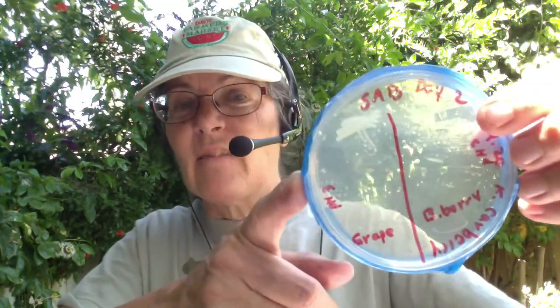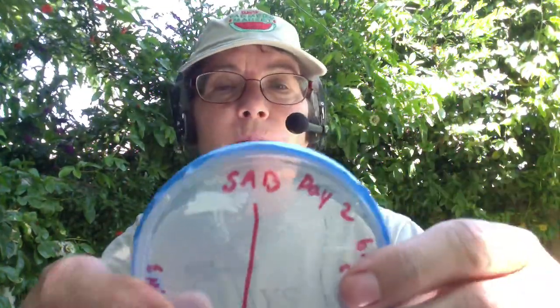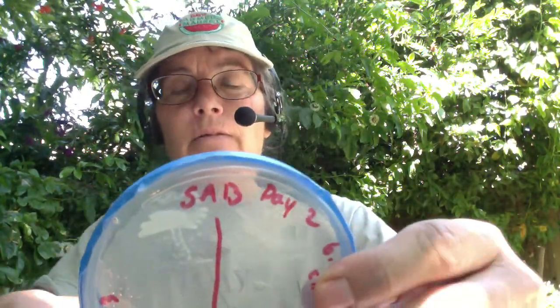Okay, obviously I have a lot to learn about making videotapes here, you guys. And also on the grape side, it looks like we're getting selection for maybe one single type of fungus. And again, we're hoping it's the Saccharomyces.